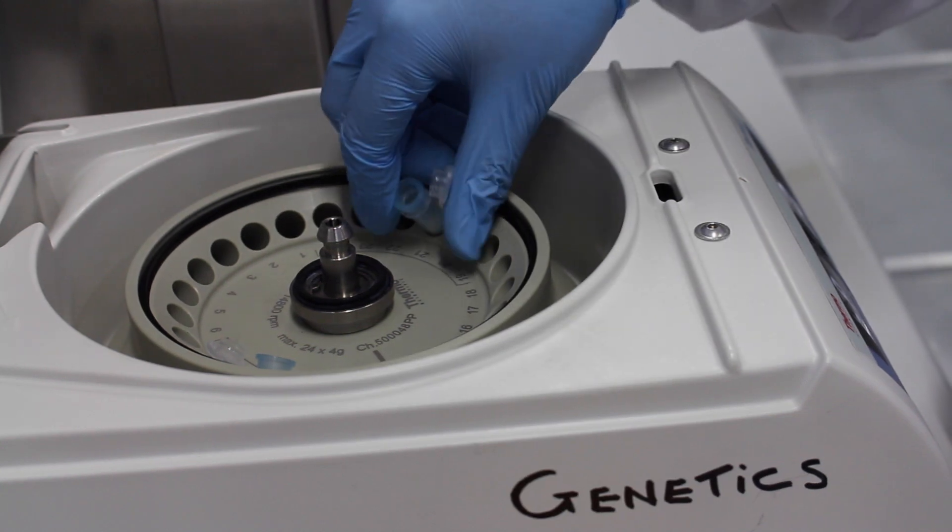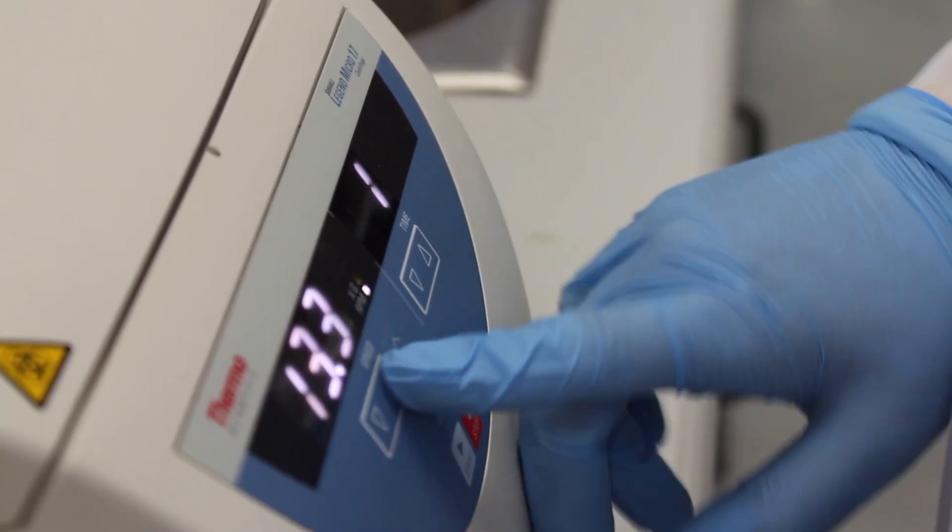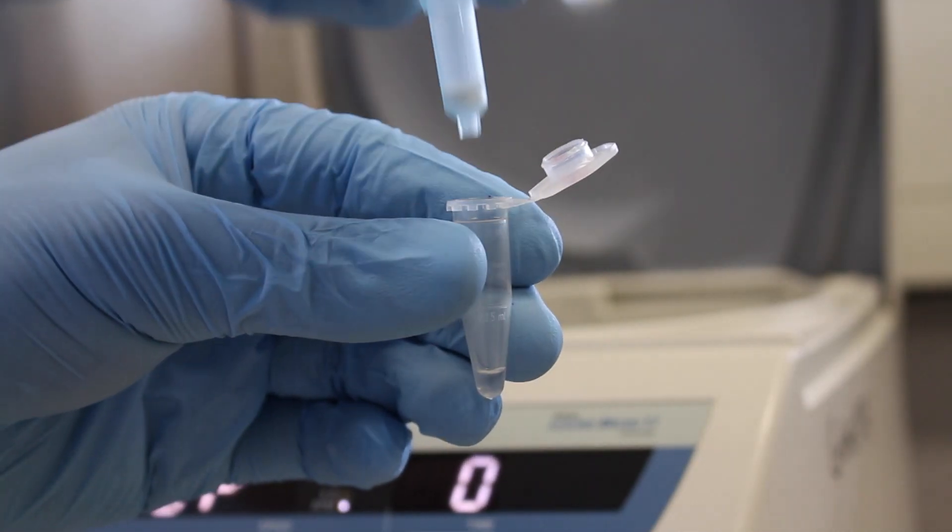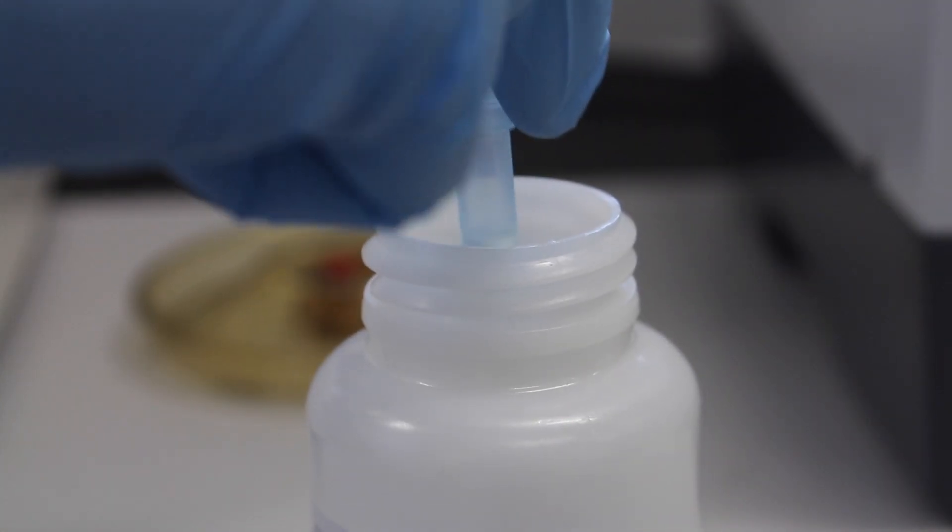The tubes are then placed into the centrifuge and centrifuged at top speed for 1 minute. This time, make sure to discard the column and not the flow through. The flow through contains the DNA.